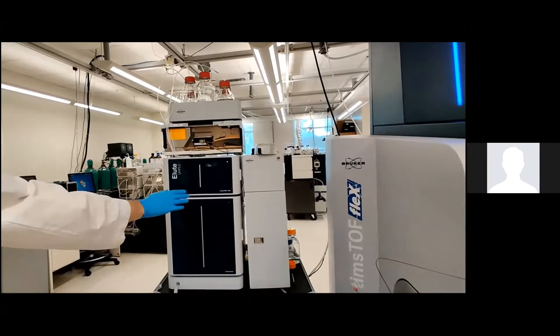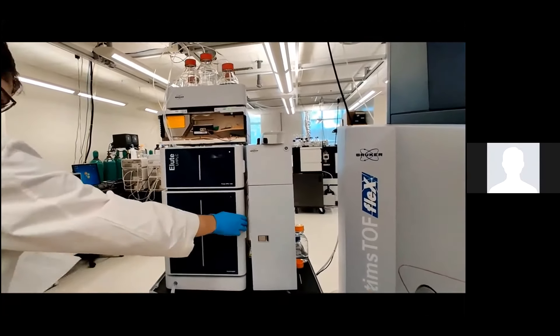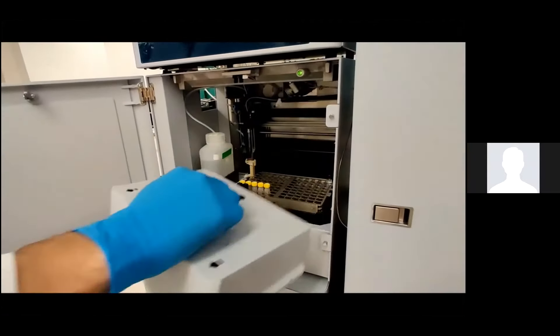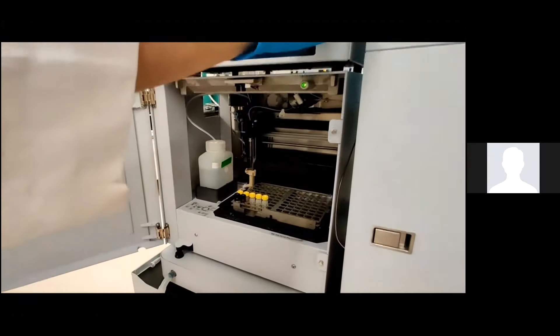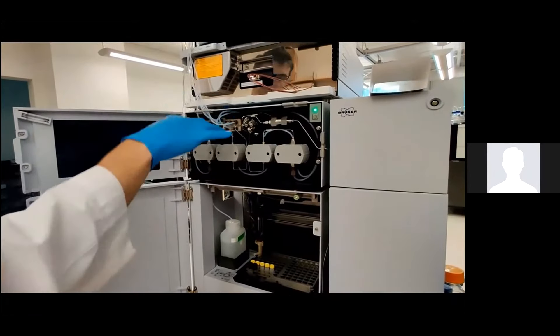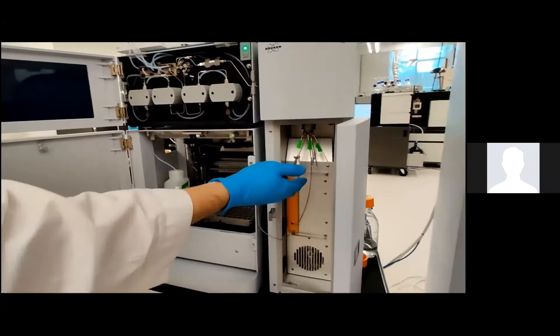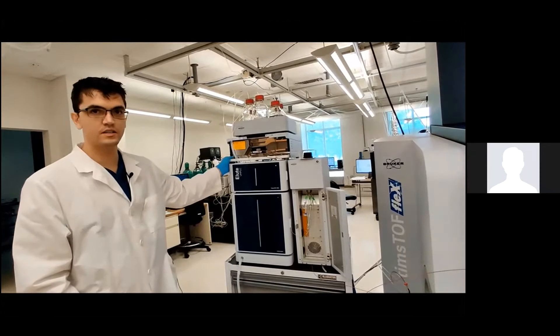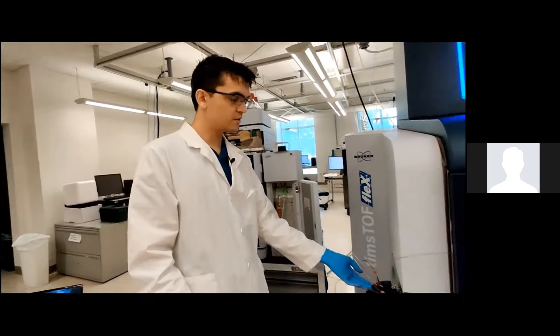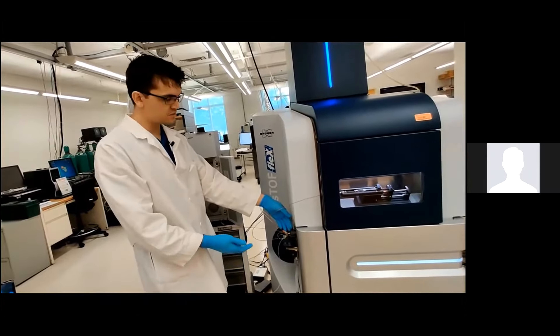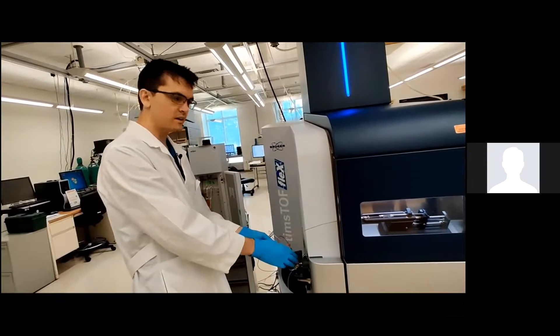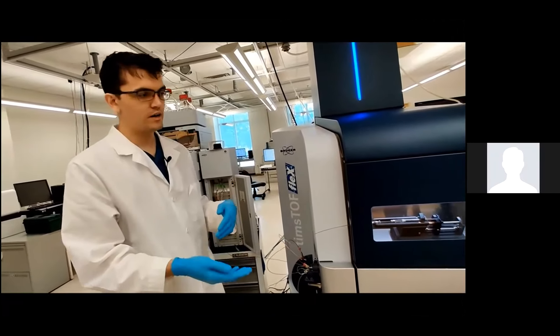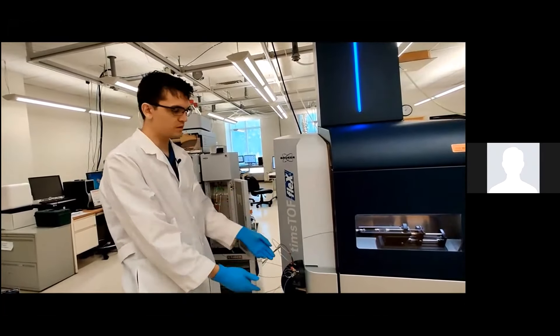So here's our Elute HPLC. And just to summarize briefly what the LC does, the autosampler has a syringe here that pulls the small amount of sample from our vials, and then mixes it with a solvent up here. And then these pumps push the sample and the solvent through a column. So once the solvent leaves the column, it can optionally be pushed through this ultraviolet DAD detector. But after that, it then goes into the ESI source. In our case, we have a switching valve in front of the ESI source. And that lets us either take solvent directly from the LC and put it into the mass spectrometer, or at our discretion, and within each sample that is ran, we can inject calibrant as well.